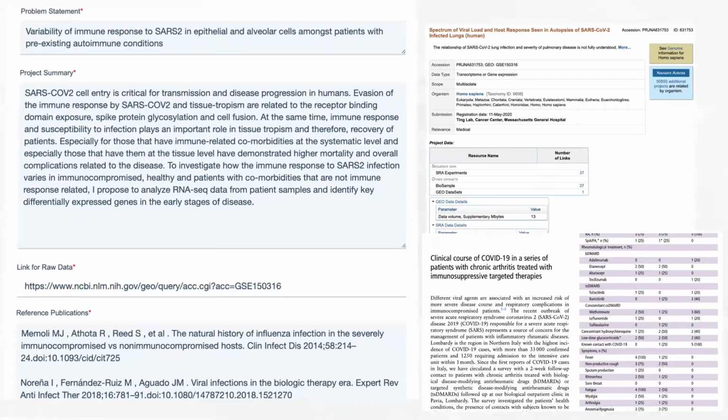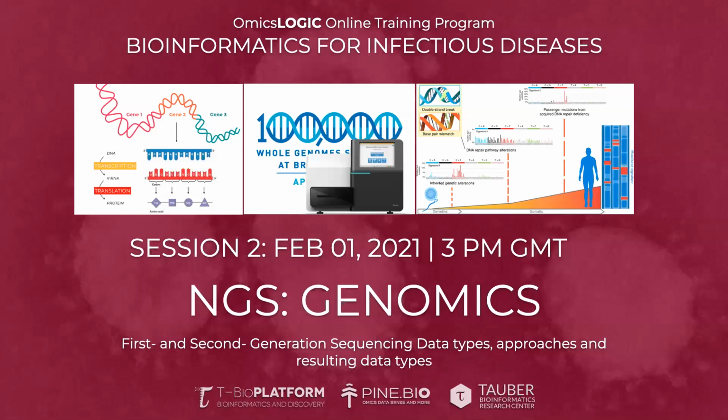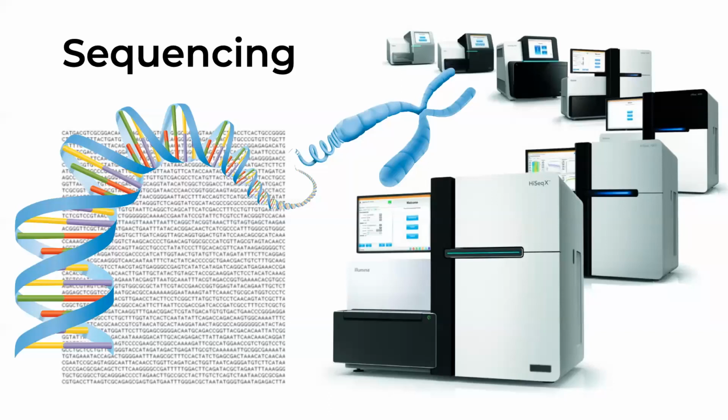So let's talk about today's topic, which is next generation sequencing genomics. Obviously, sequencing has been such a prominent data type in the context of infectious diseases. We need to understand what the basics are and what the data formats are. And I know that for some of you, this is going to be repetitive. You probably know a lot about this.